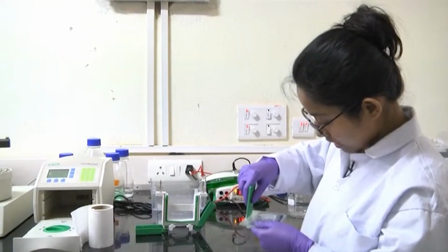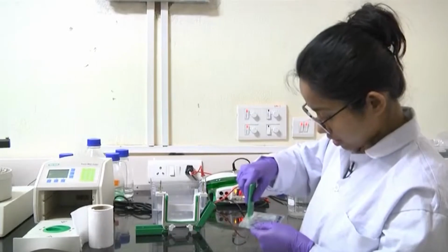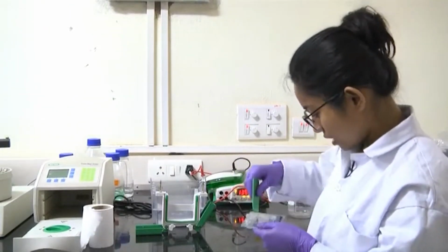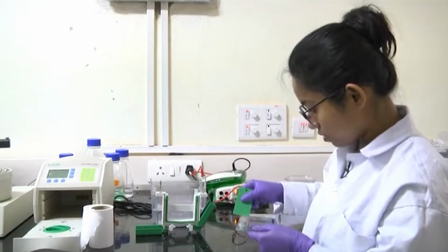You don't need the whole gel, so don't go for whole gel blotting, because then you will need a much longer piece of membrane, and as I mentioned, the membranes are quite costly.